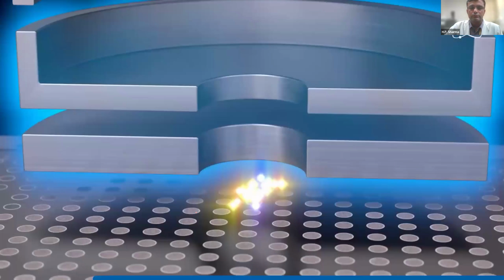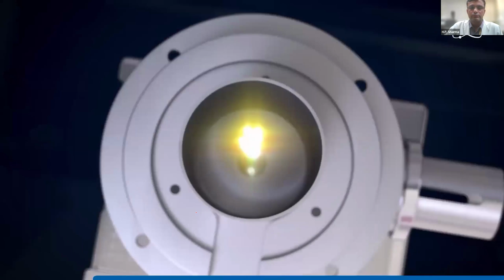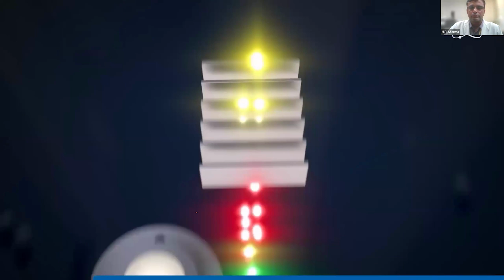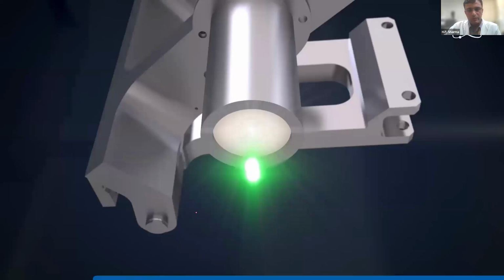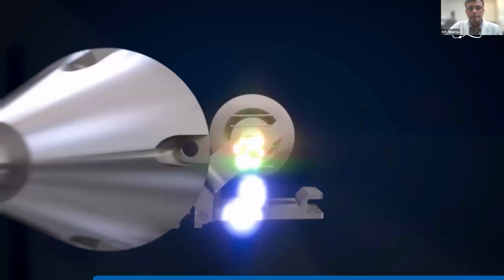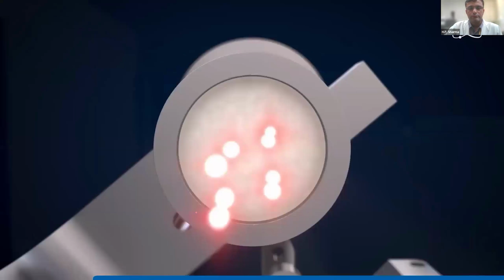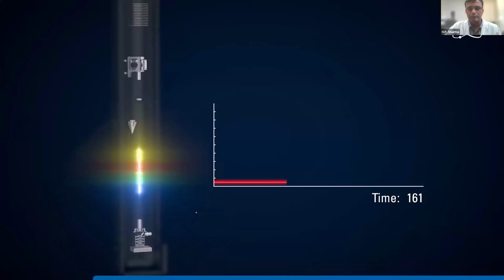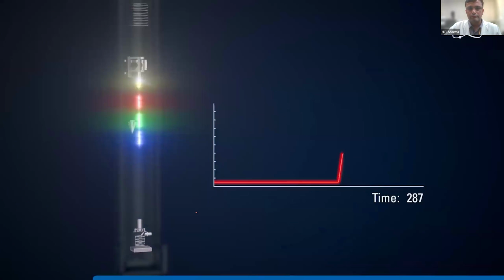High voltage is then applied to accelerate the charged particles. The second step is the time of flight mass spectrometry phase. In the linear mode, particles will impinge upon the linear detector within a few nanoseconds after ionization. Higher mass molecules will arrive later than lighter ones. Flight time measurements make it possible to determine molecular masses directly. Each peak in the spectrum corresponds to the specific mass of the particle.